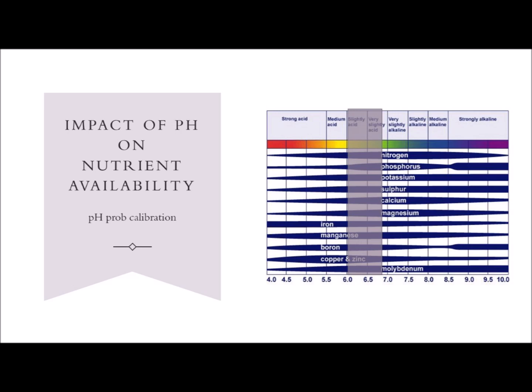And it is really important to understand that and calibrate whenever we feel that it is giving you a little trouble or some issues. If there is no issue also, I would suggest every week or every 15 days you calibrate your tools, and specifically the pH and EC meter.